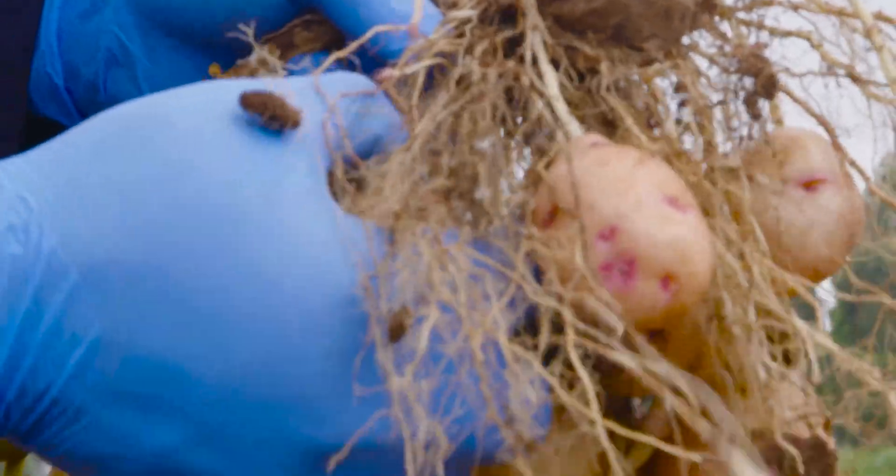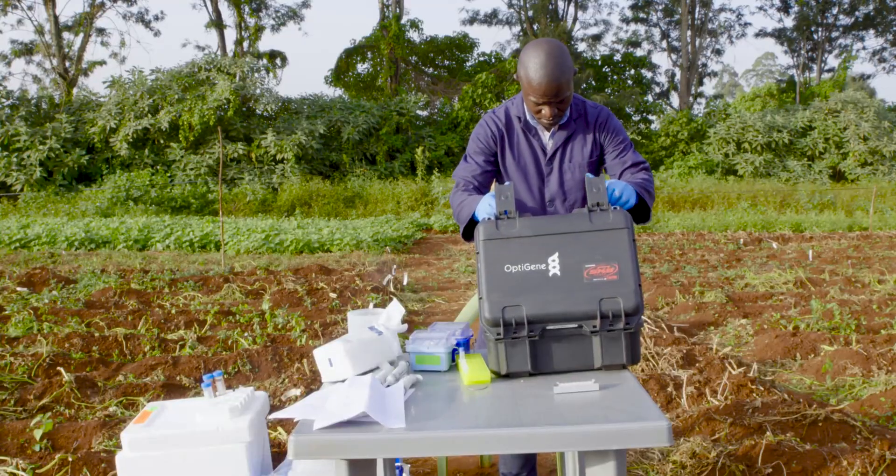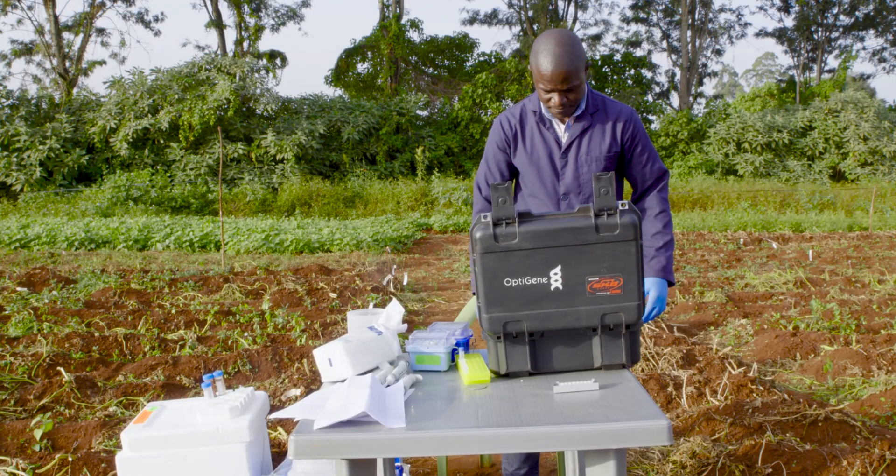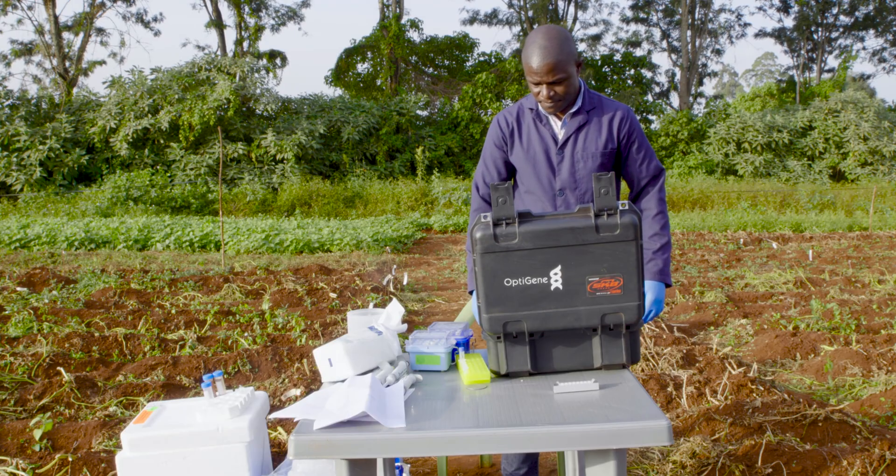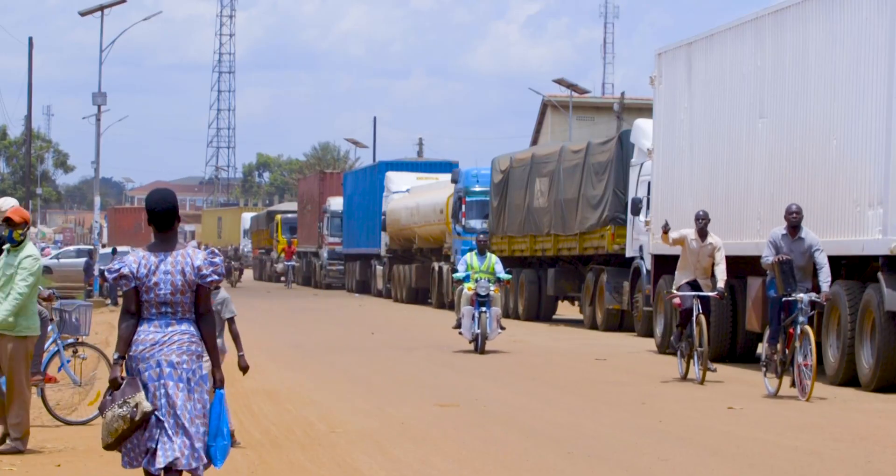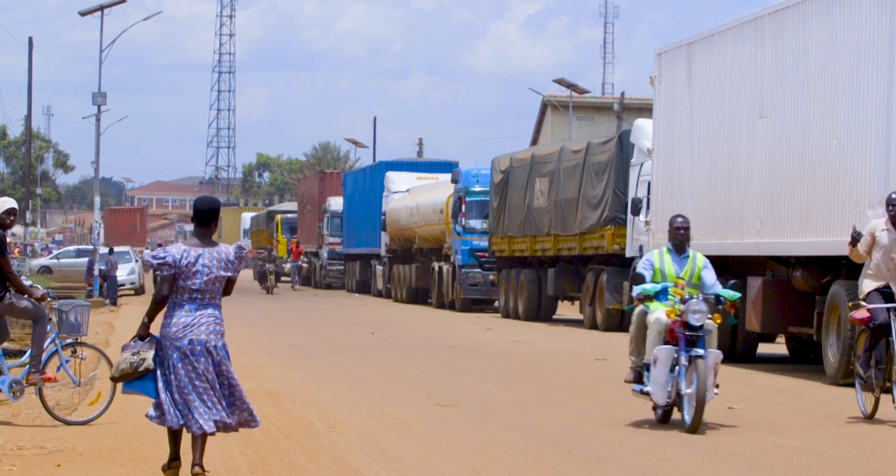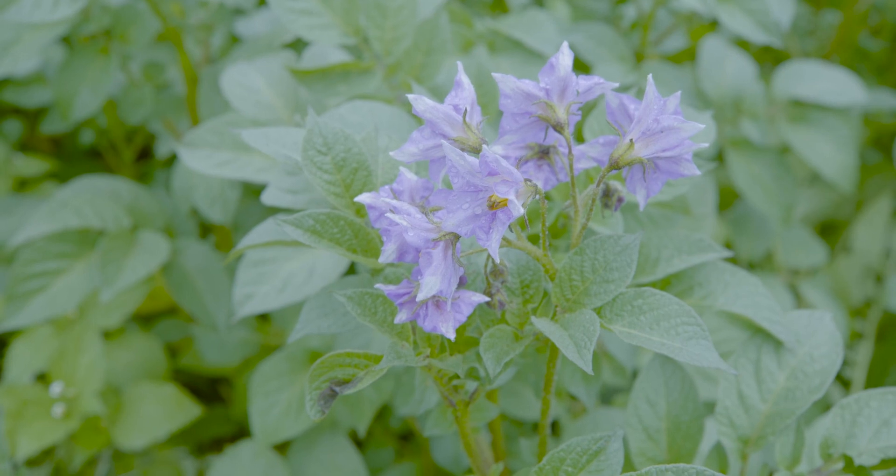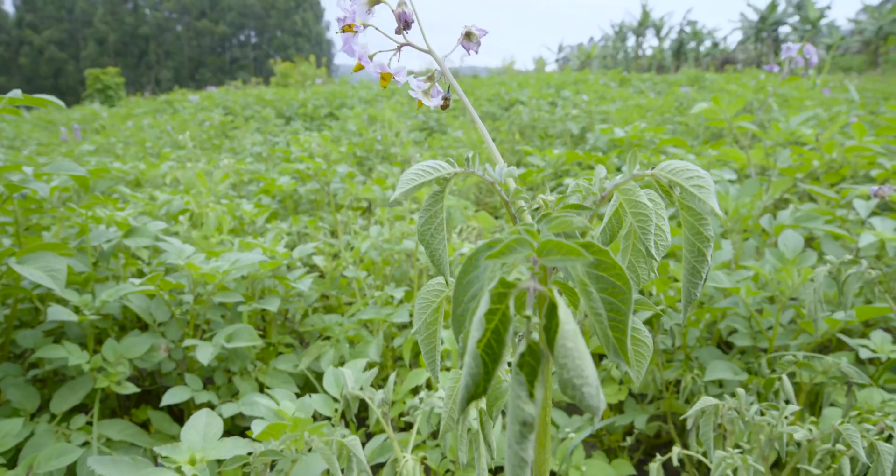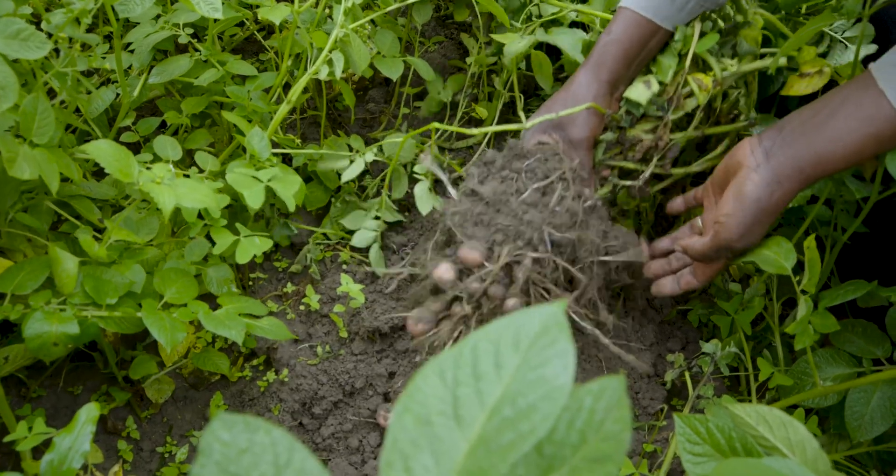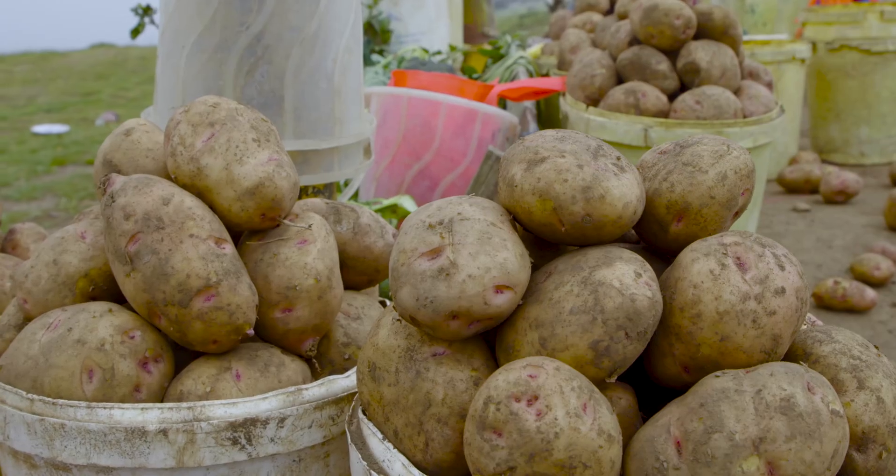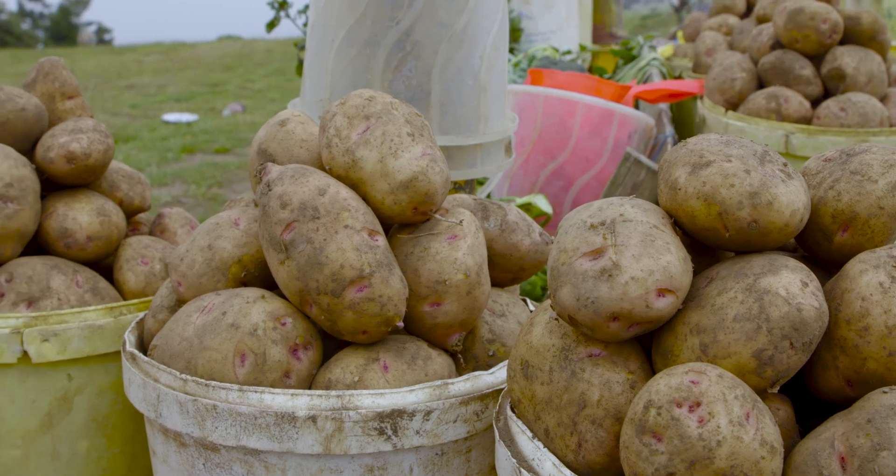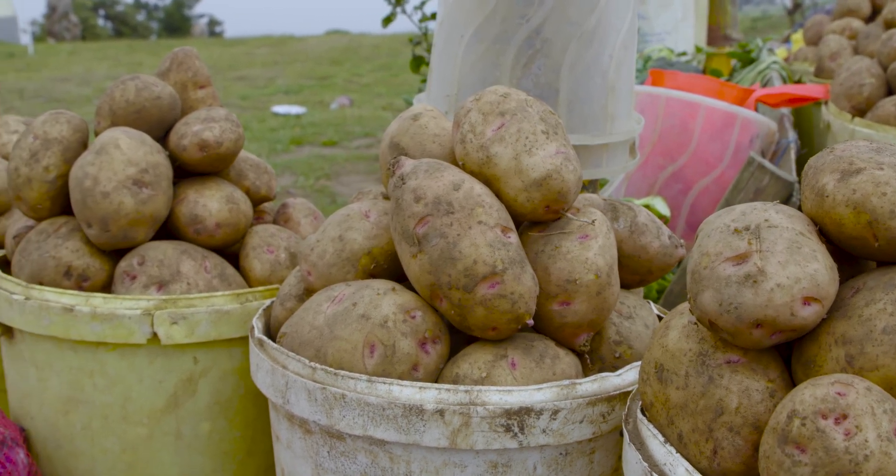Certified seed is a sure-fire way to help bolster potato production across sub-Saharan Africa. The LAMP assay is a versatile, cost-effective tool that brings the power of diagnostics right to the settings where it is needed most. It can be used at ports of entry and in farmer fields, helping to rapidly diagnose latent infection of bacterial wilt and help mitigate its devastating spread. This low-cost approach is an essential tool in strengthening the potato seed system and making the certification process for seed potato more widely accessible.